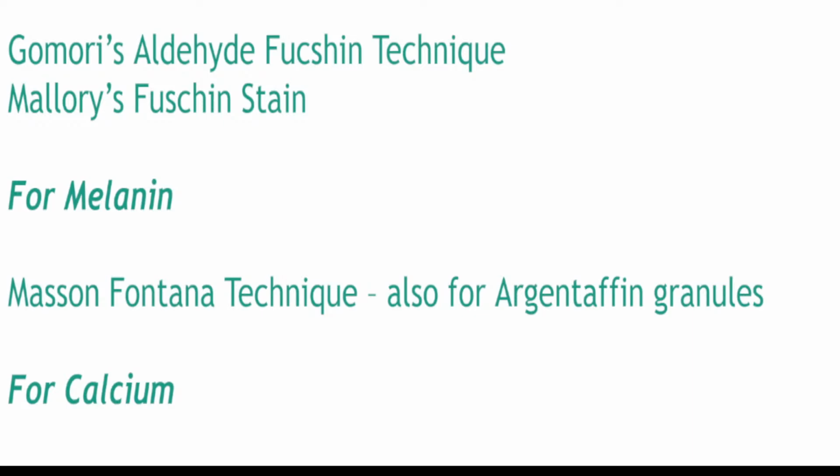Okay, for copper, use the rhodanine technique. Okay. Next, we go to lipofuscin. Lipofuscin is demonstrated with Mallory's fuchsin stain, aldehyde fuchsin stain.